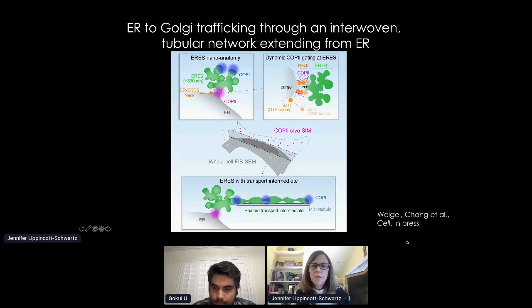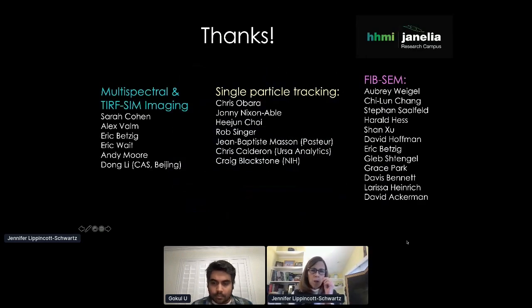Yeah, basically, in our lattice light sheet movie, when we segmented out each individual mitochondria, we could see that there was very intimate association with ER somewhere along that surface. The finer question, I think, is what tethering proteins might be underlying the contact sites that you're seeing. That's a question that we're really interested in now.